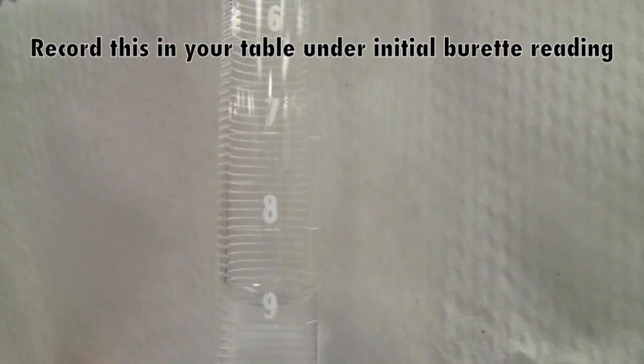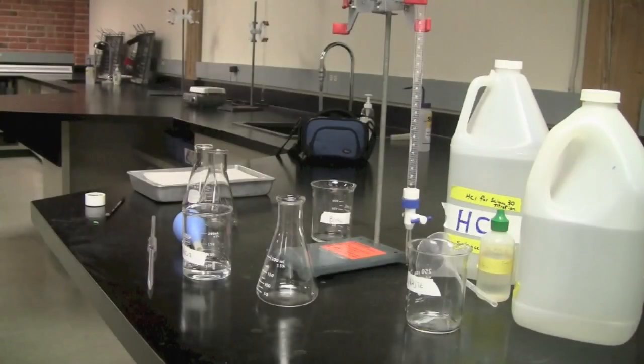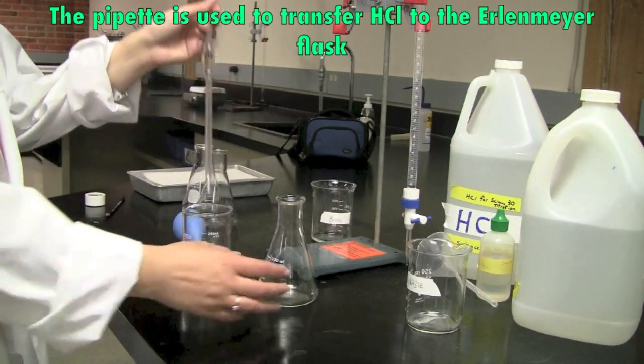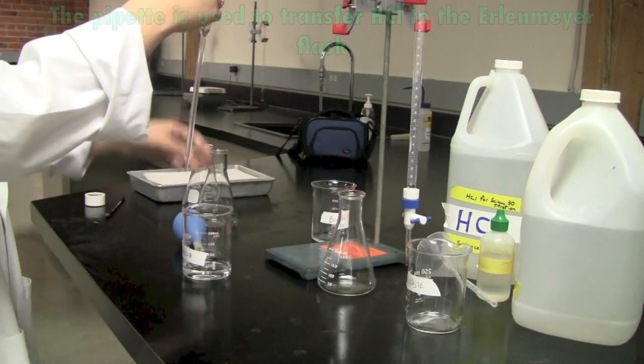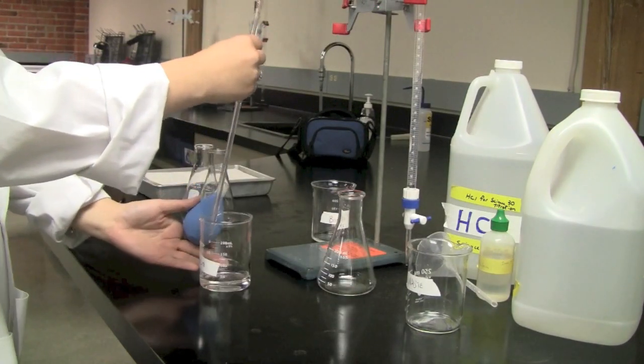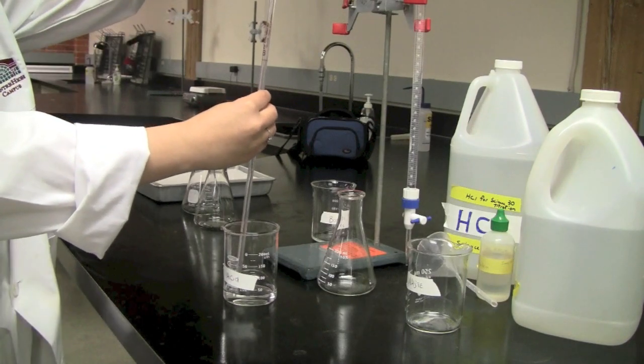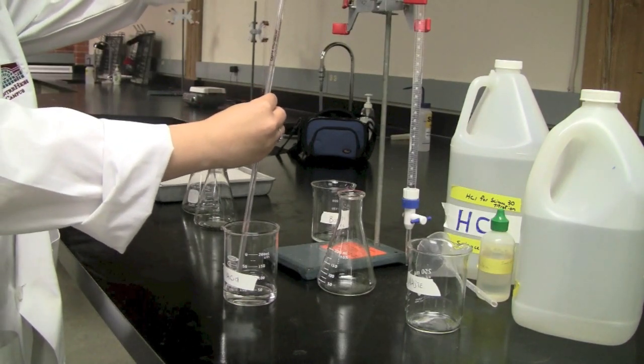It's around 8.9. So what you're going to do is you're going to use the 10 milliliter pipette and you're going to use a pipette bulb to assist you. You're going to transfer a small amount of hydrochloric acid to the Erlenmeyer flask.